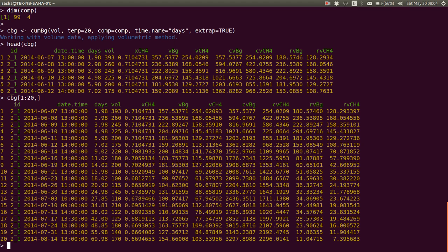So now we have interpolated, or extrapolated, biogas content, standardized volumes for each interval, the V columns, cumulative volumes, CV columns, and then rates, the RV columns, the last 2 columns.